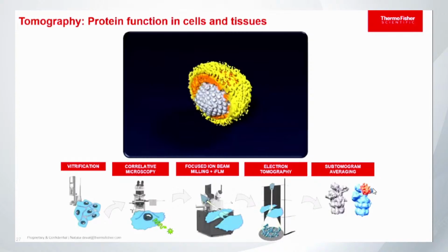Specifically with the virus, it's still an easy target, but if you are working with cells, lamellas and organelles, you will need to do segmentation work. And with the segmentation work, even though we have a program called Amira to do it, there are still plenty of manual steps, where you need to be there to do all that work. So we are trying very hard to automate and make your life easier for tomography as well, to get to the level of single particle analysis.